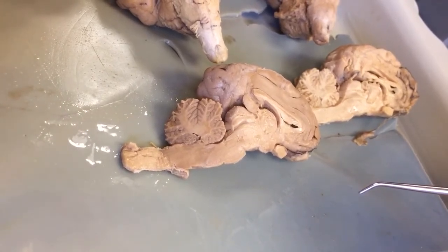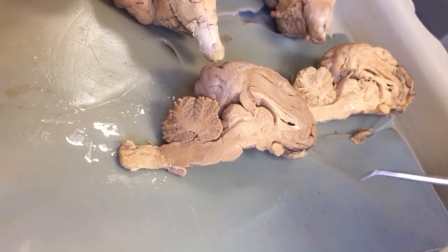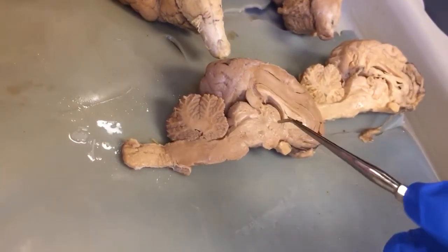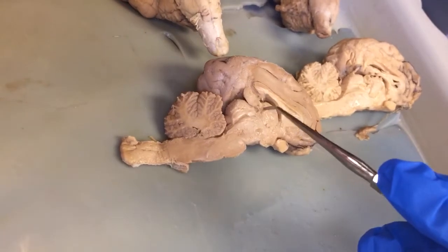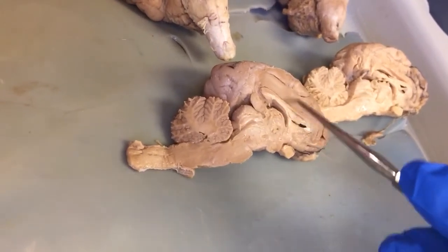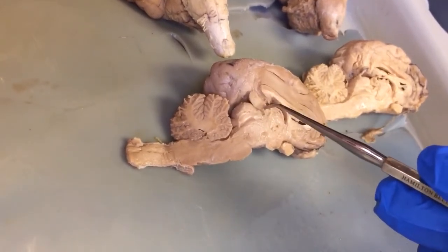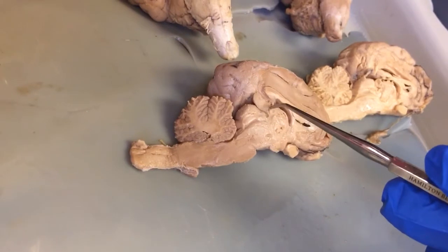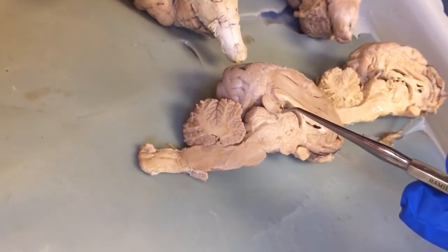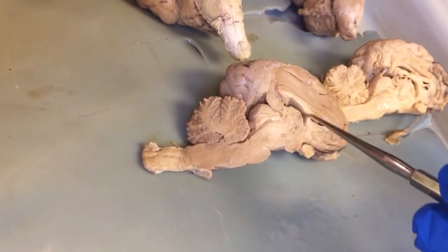The habenular trigone, that one's still like a bump. It's a bump between the pineal gland and the intermediate mass. So it's kind of difficult, but it's this little part here. You've got the main intermediate mass here, the pineal gland here, and this little habenular trigone is right here. The space in front of the intermediate mass is called the foramen of Monro.